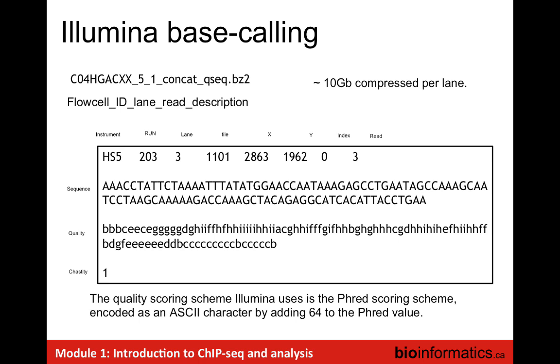So you might have heard of read groups. Read groups are a way of identifying that this chunk of reads is in one group that has this unique identifier versus another group, and then you can merge those into the downstream BAM. Okay, so the sequence, of course, is there, and then the quality scores are there, right? So these are base quality scores.